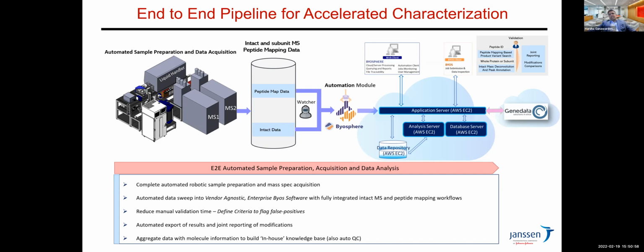Currently, most of the data analysis for higher order structure I'll be showing today is not a part of this workflow and requires specialized software tools. However, as we gradually evaluate and add new capabilities to this workflow, BIOS will be able to provide both primary structure as well as higher order structure analysis in the near future.